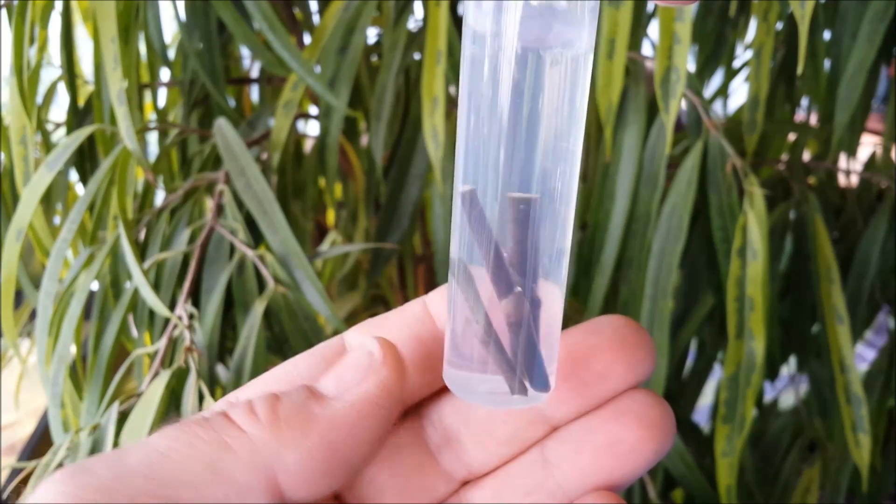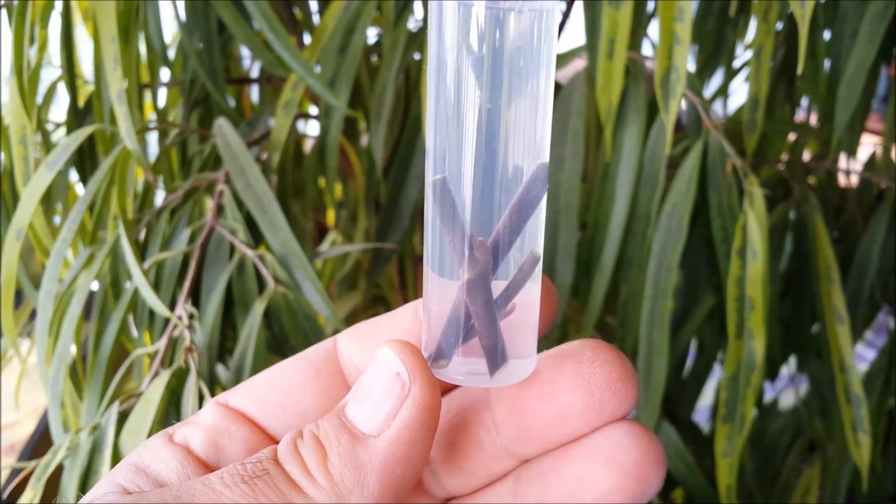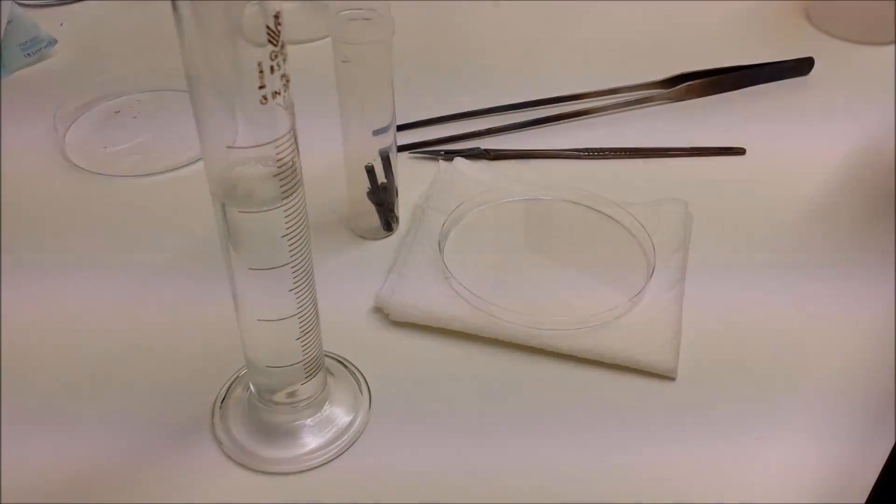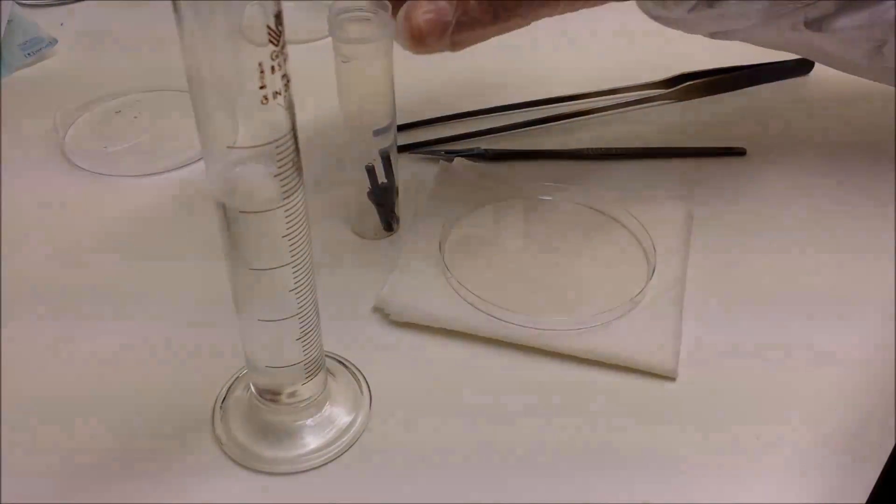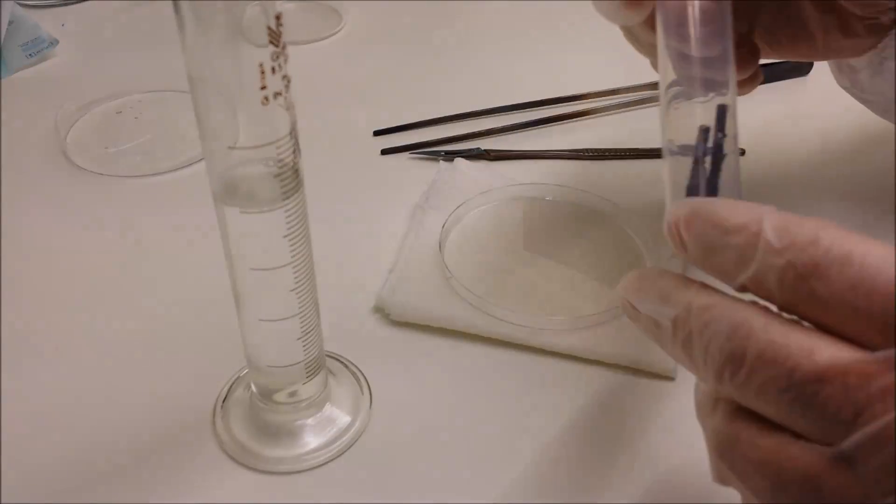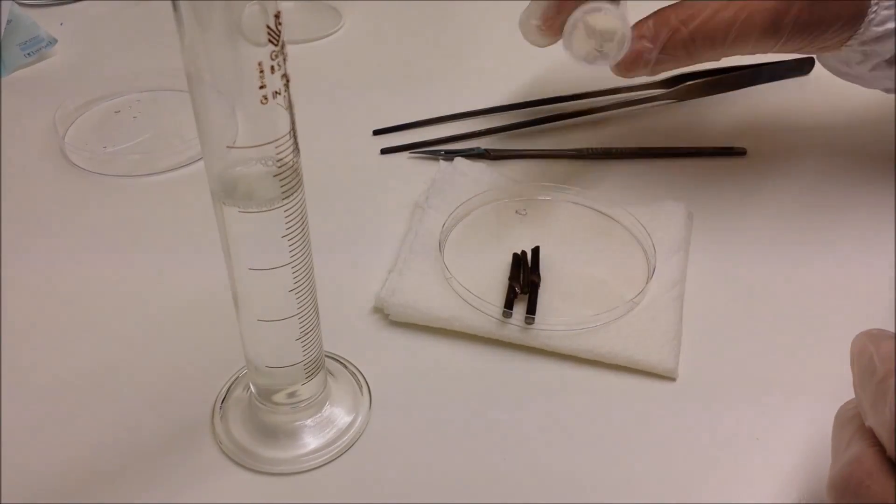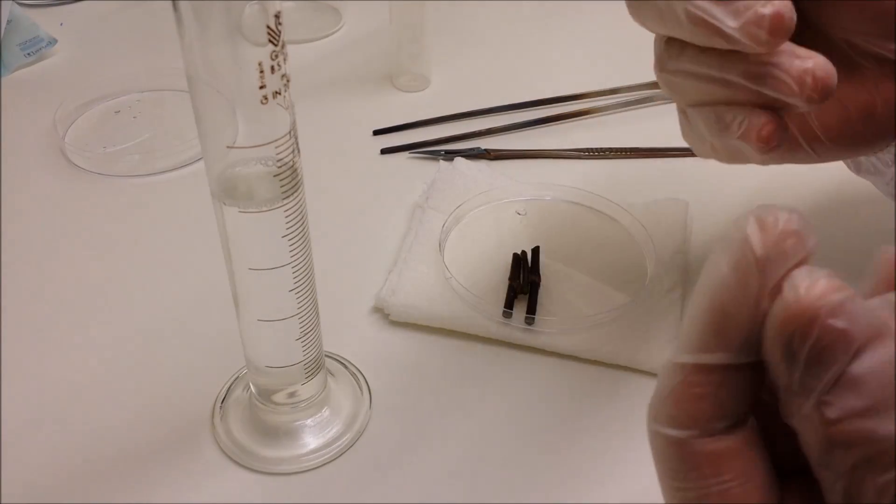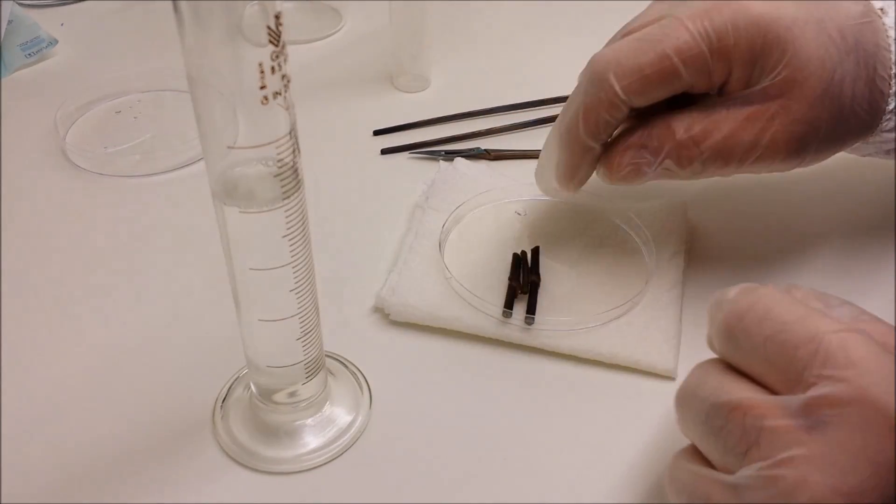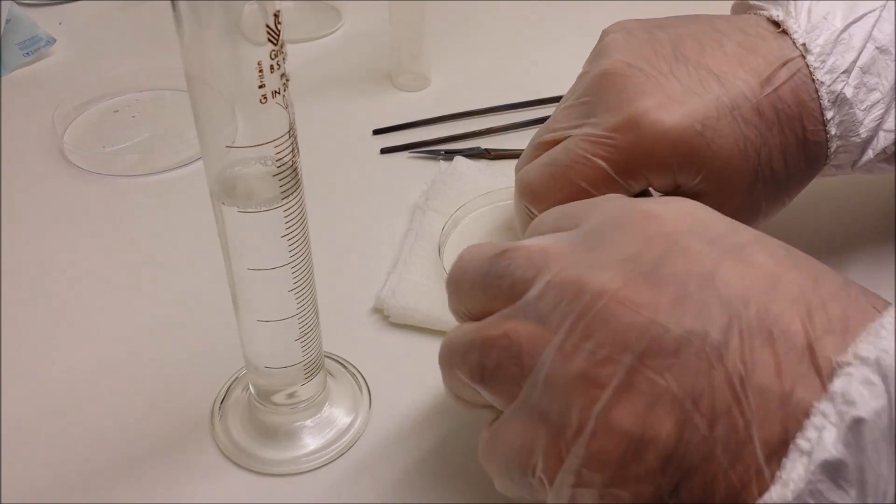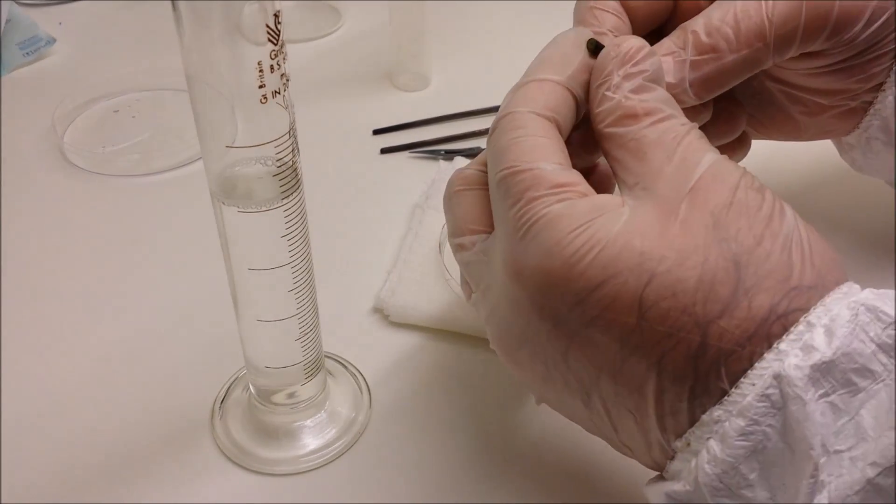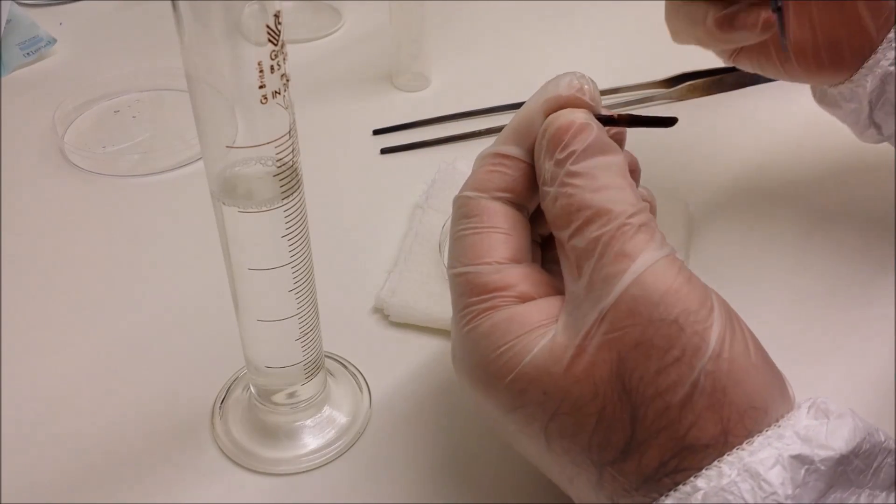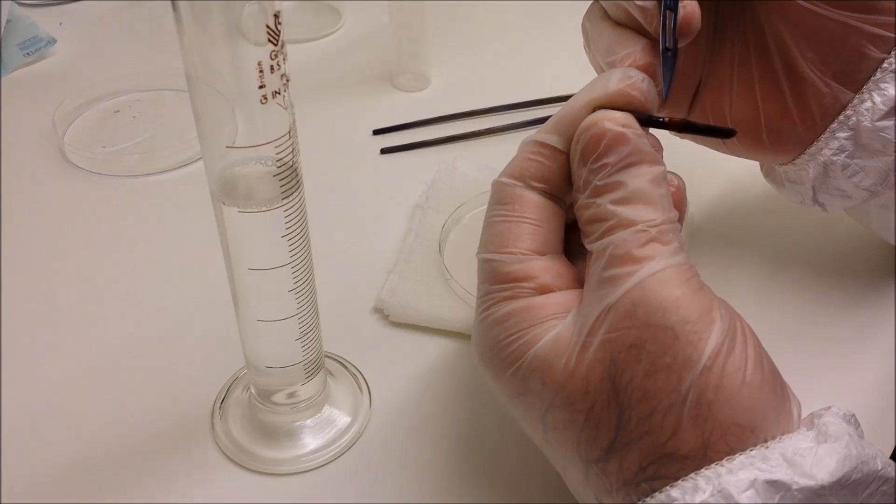Now that the stem cuttings have been soaking for 15 minutes, we can empty them onto the sterilized petri dish. Now I've already in advance sterilized my gloves with ethyl alcohol or isopropyl alcohol to remove any bacteria.